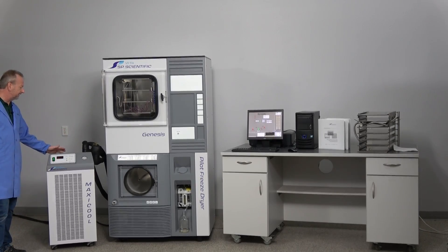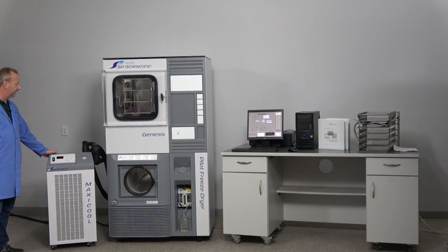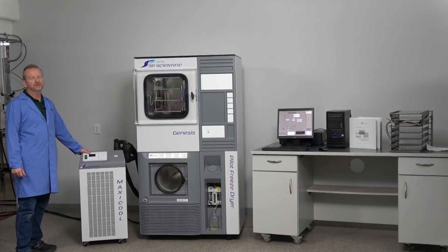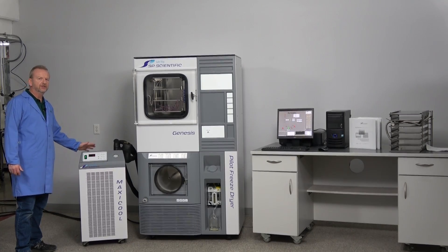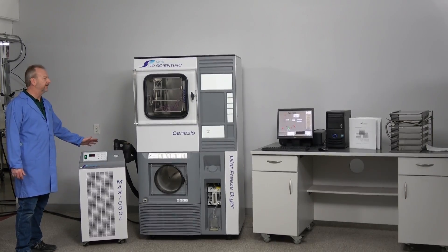Over here where I'm standing is a chiller unit that is chilling the refrigeration unit on the Genesis. It's an option that a lot of machines don't have. If your facility has a central cooling system, you can hook directly to the machine, but if not, you'd use this chiller to eliminate heat build-up in your lab or production room.